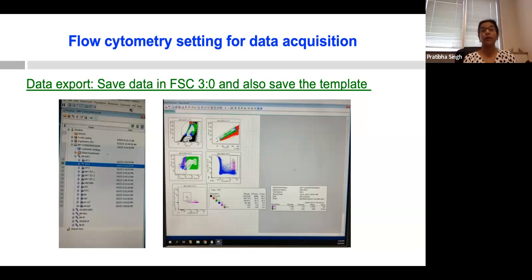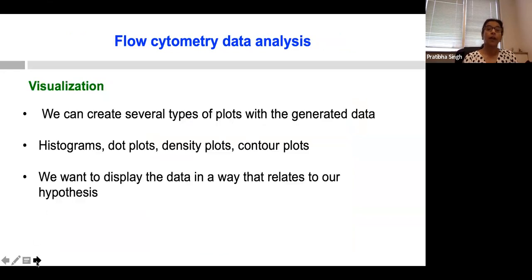Once you have data, you can use software to analyze it. Normally we use FlowJo software. For analysis, it depends on how you want to see your plot.